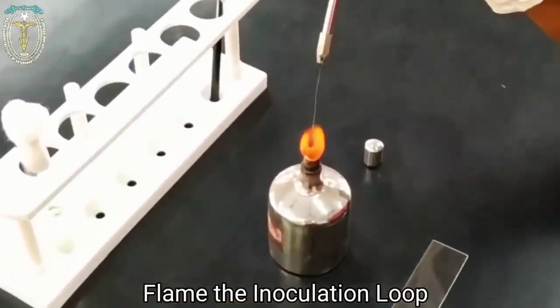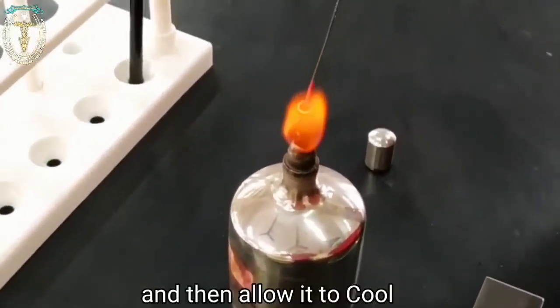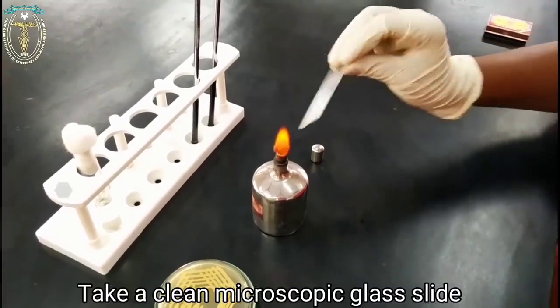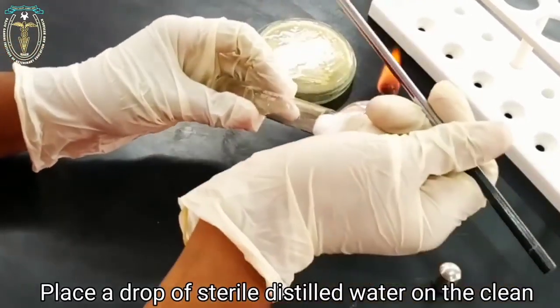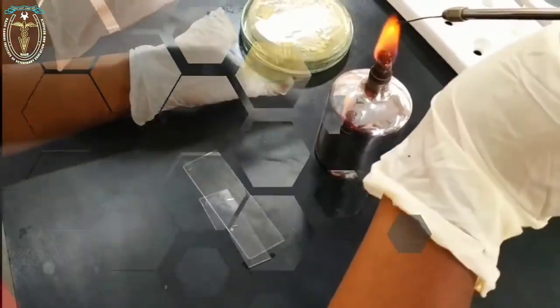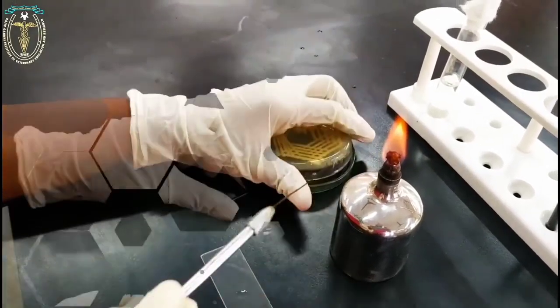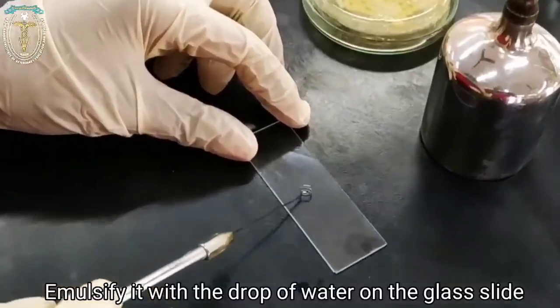Flame the inoculation loop to red heat, and then allow it to cool. Take a clean, microscopic glass slide. Place a drop of sterile distilled water on the clean glass slide with the help of the inoculation loop. Take a small portion of the bacterial colony from the bacterial culture plate and emulsify it with the drop of water on the glass slide.